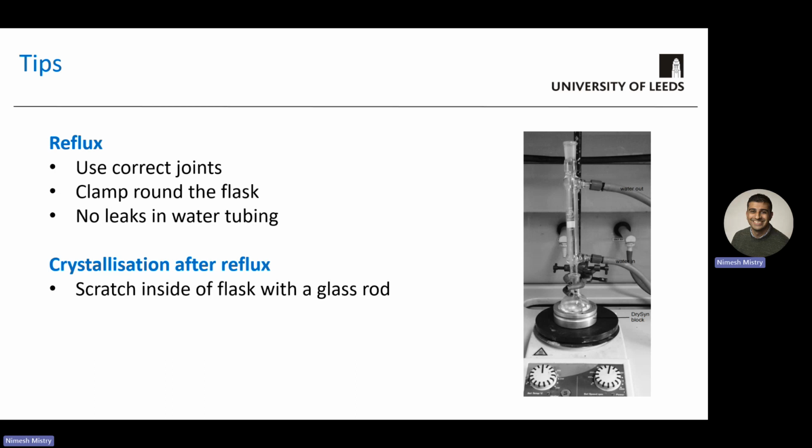In your lab drawers, you've got a number of different round bottom flasks and condensers that you can use, but you need to make sure that you're using the correct size flask and condenser, so the neck between the flask and condenser fits very snugly. There are no gaps of air between them, so when you're heating your reaction mixture, the vapors from the solvents can't escape. They should all be rising through the middle of the condenser, where the water from the condenser will cool it down back into the flask.